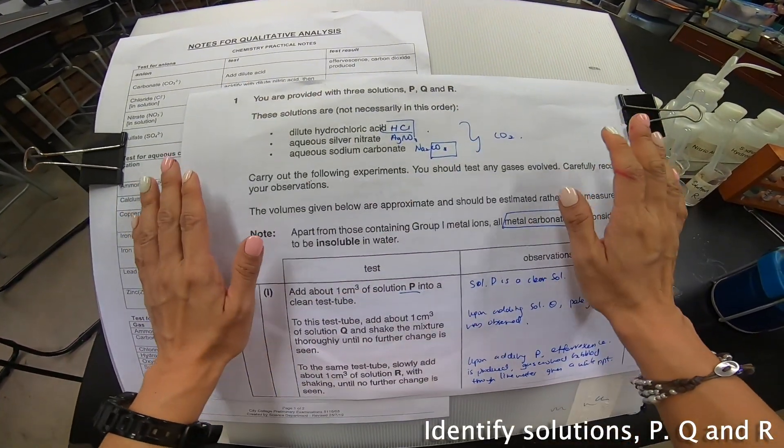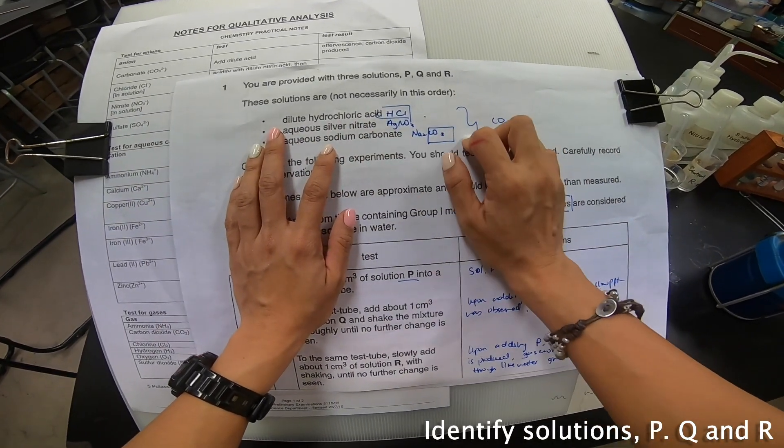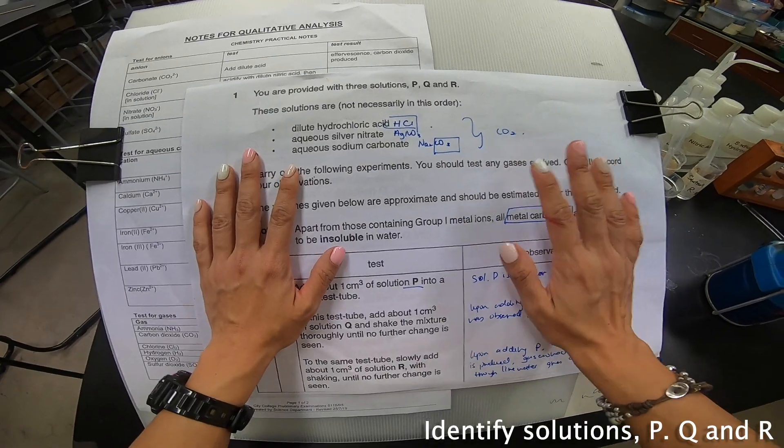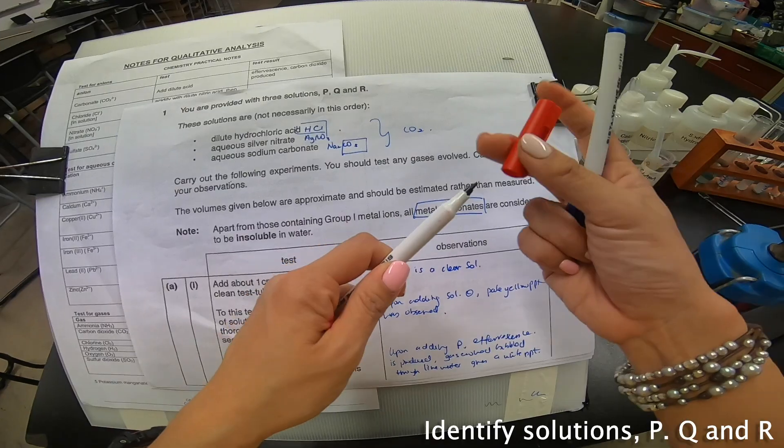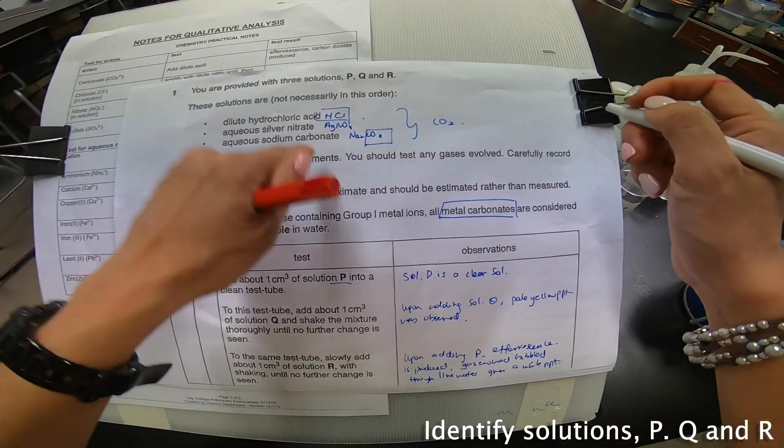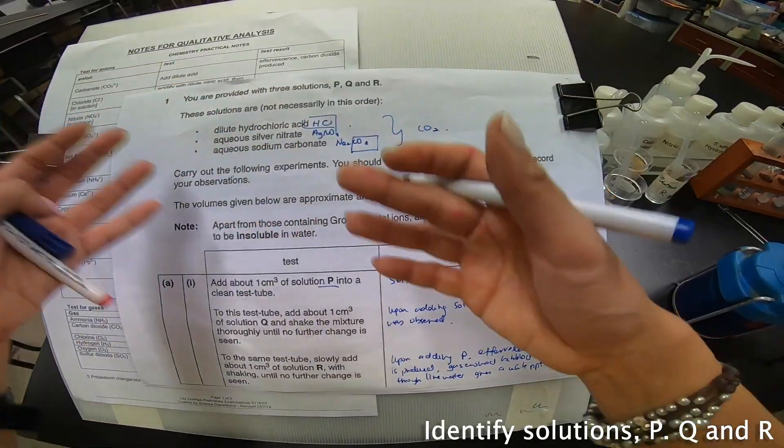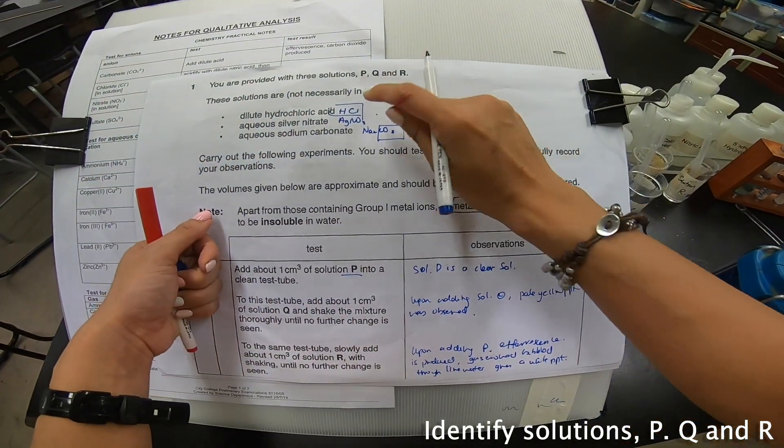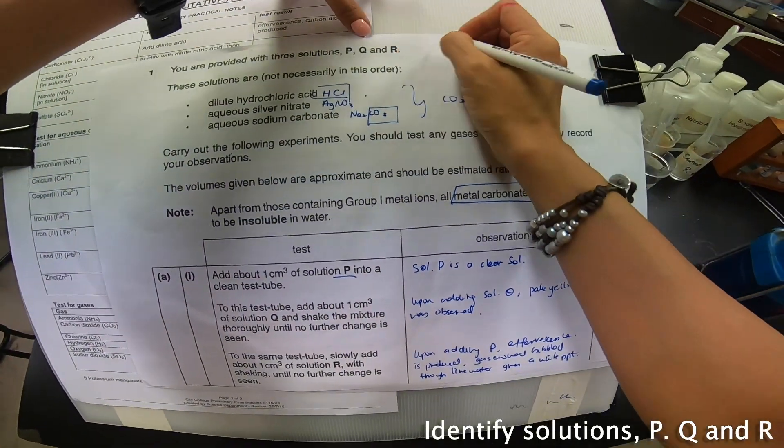Now, first of all, I don't know who they are, but I do know that I have all this solution. Now, as a good student, you can actually come up with equation. So I'm going to teach you how I will solve this question. First of all, I will start by writing equation to understand how all this mixture mixed together because basically it's one of them mixed with the other one, mixed with the other one. So are you ready? Let's begin.